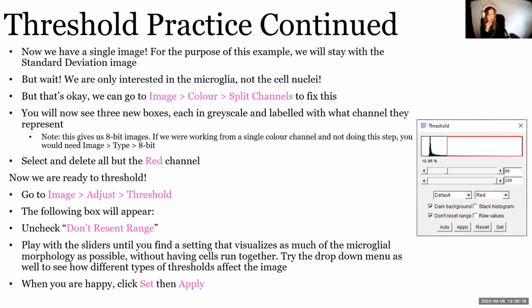All right, I'm going to give you another couple minutes on the clock to try to get through the thresholding. And for people who are working on this, please also go ahead and pop done in the chat when you have gotten through that.